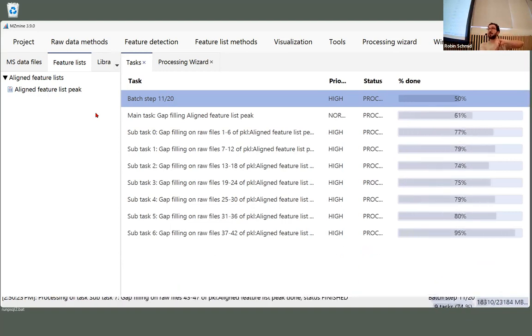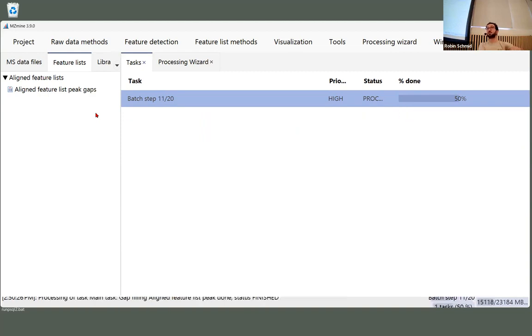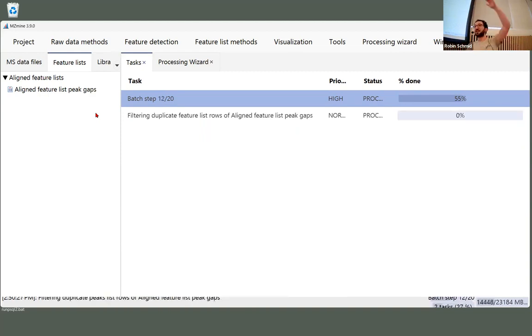And so there it's very important that if your study scales, of course you can try your old parameters, but maybe it's also better to just raise some of the thresholds and raise some of the filters, and then just rely again on the gap filling, because alignment and gap filling are fully parallelized, so it runs all in parallel, and it's going to be quite performant there.